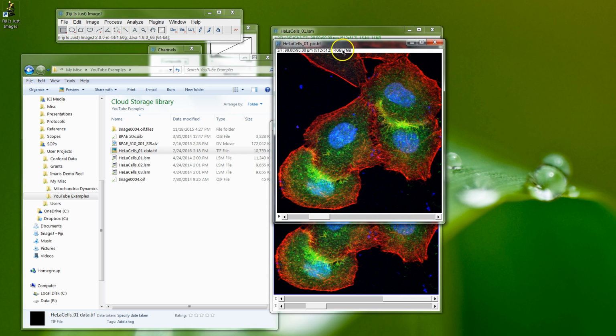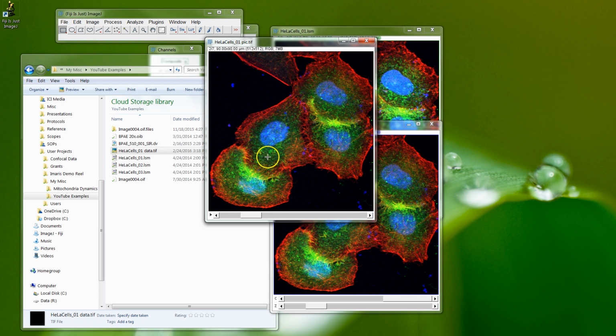And this one here is the one we were on. And if I move the mouse pointer around here, if you look at the value up in the window as I move around here, you see I've got 3 different colours, one for the red, green and blue, and that's what it uses to make up the picture.